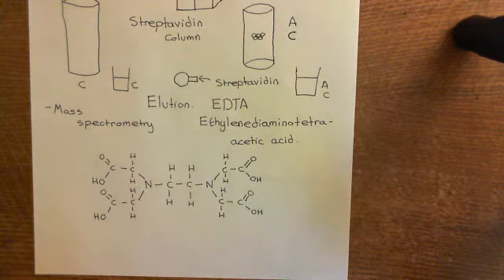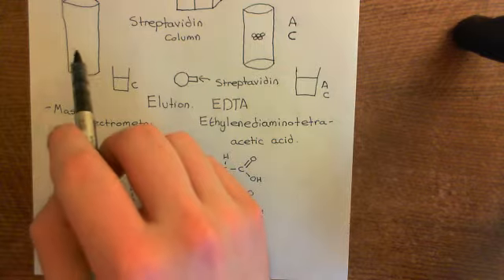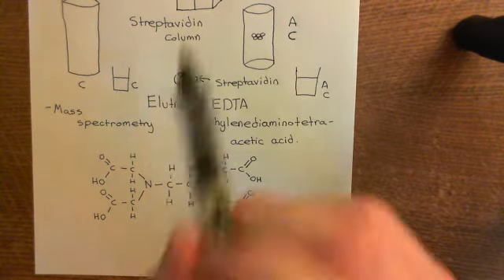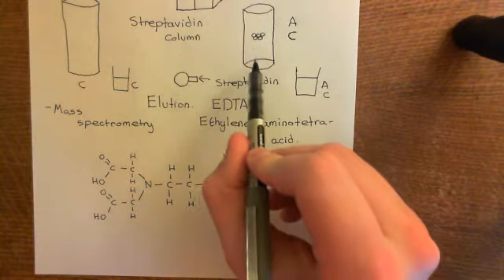On the other hand, there are some proteins which will just bind to the beads whether or not they have BMCC molecules bound to them, and those will bind both in the control and the non-control, whereas the proteins which are only binding because they have the BMCC molecule added onto them, which indicates that they originally had palmitoyl groups on them, those will only bind in the non-control.